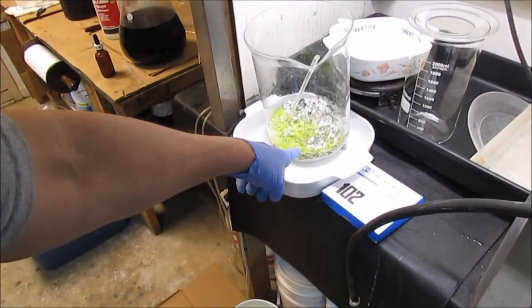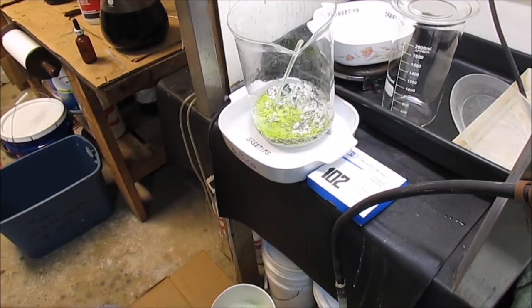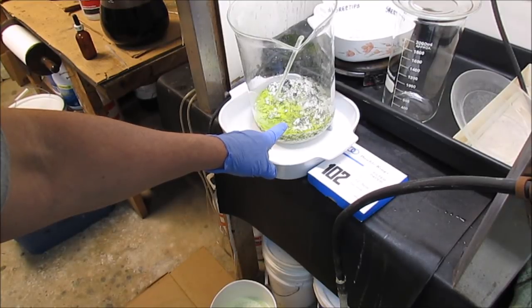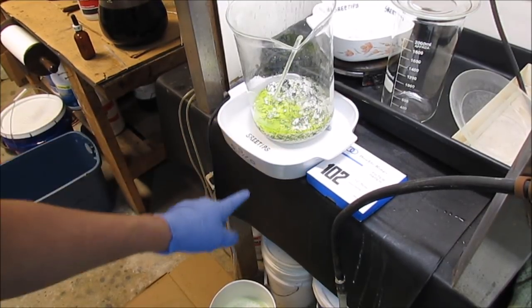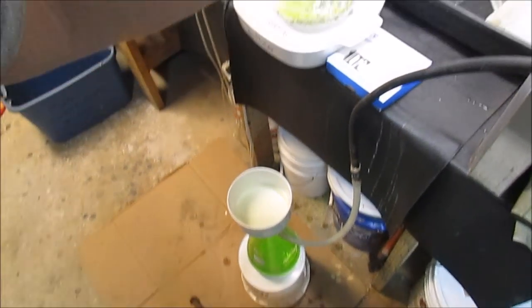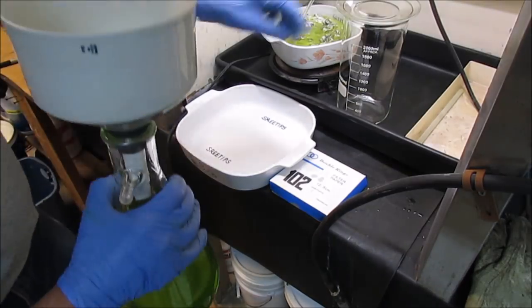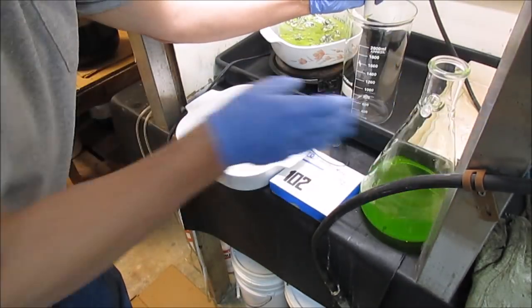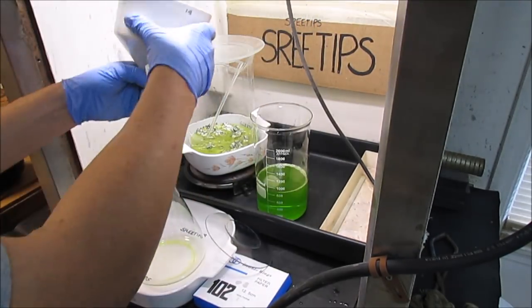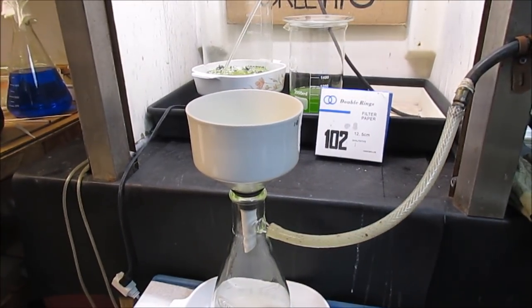When I pour this fine particulate matter into that funnel, it's going to take probably several hours to filter through, because it's going to load the filter paper up and slow the filtering process way down. So rather than running all the liquid through that, I got the easy liquid out first, and I'm going to go ahead and harvest that and put it in this beaker. Now I'll filter the rest of the particulate matter out of that beaker.